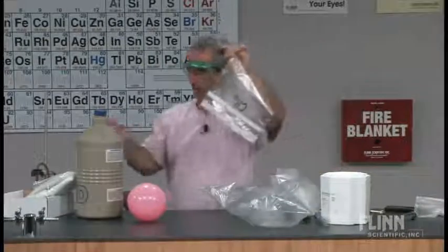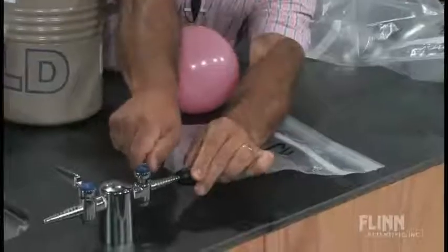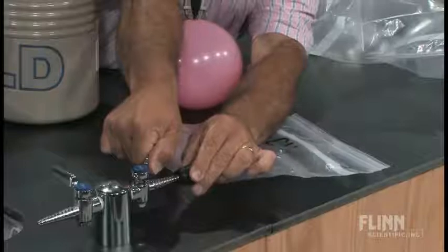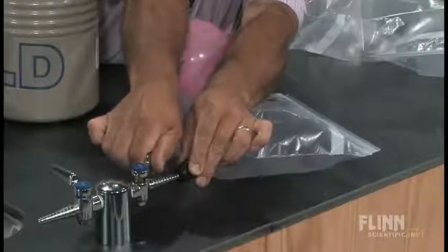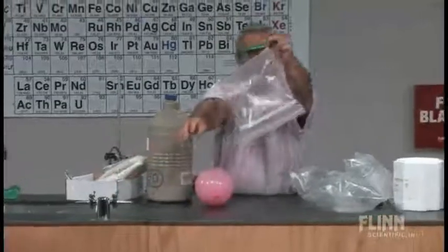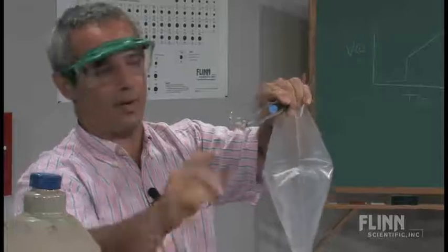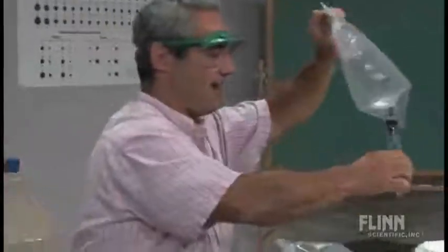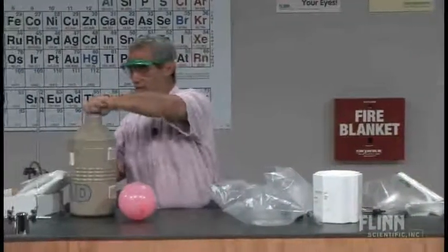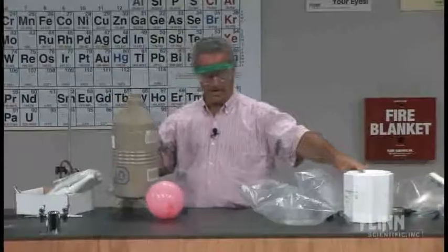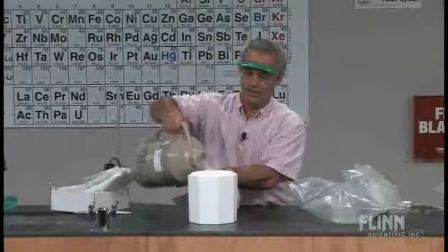Let me make sure that test tube doesn't roll away. And just to give you an idea, these are one-hole stoppers. So all you have to do is fill it up like that. Put my finger over it there until I'm able to get in the test tube. I didn't get this filled up. If I wanted to, I could flush that with a little methane. It doesn't really matter. This is mostly the methane. Enough of it's leaking down in there.